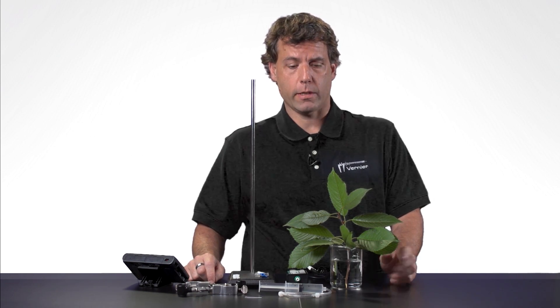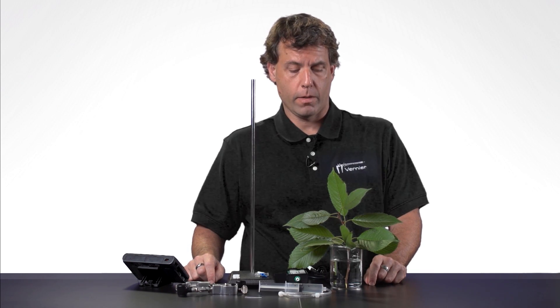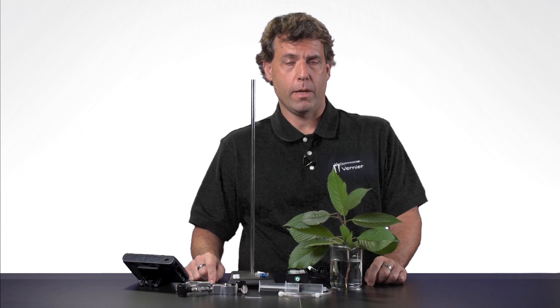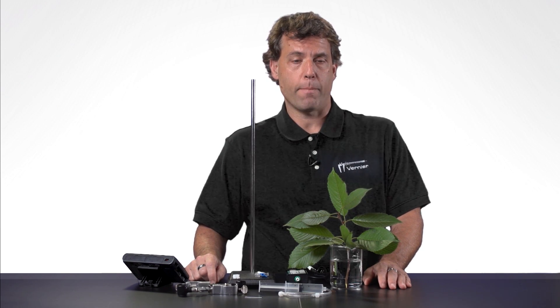Hello, I'm John Melville from Vernier Software and Technology, and today I'm going to be showing you how to conduct a transpiration experiment, or to measure transpiration from a plant. This is a very popular lab that can be found in Biology with Vernier, Advanced Biology with Vernier, and also our Investigating Biology with Vernier lab book.